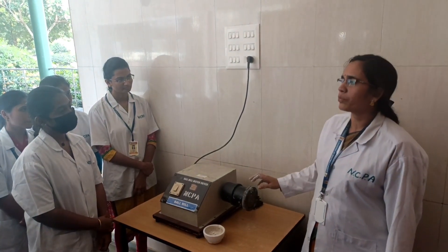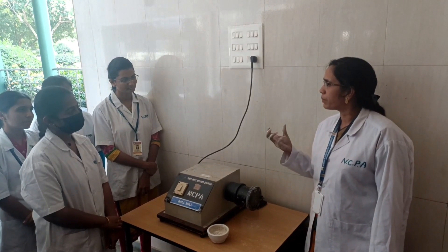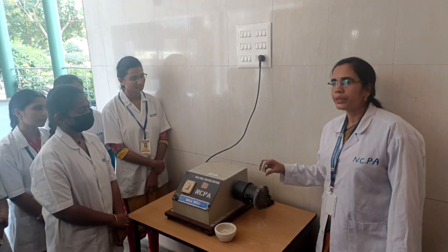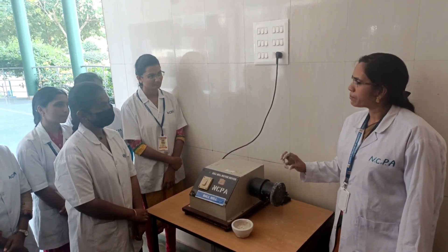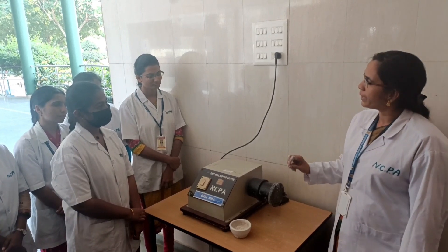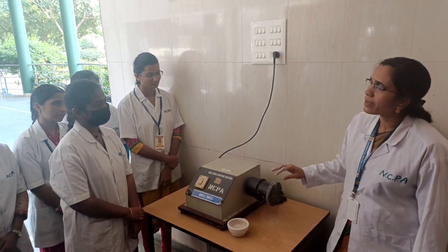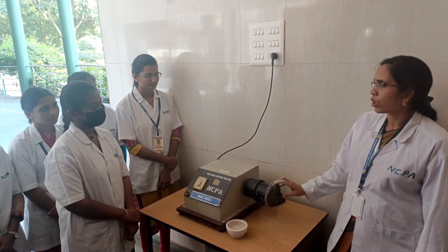After a certain period of time, depending upon the size of the pebbles or materials used in the hollow cylinder, due to the attrition caused by those bars, the bulk material will be converted into very, very small sized particles. Due to this, loss of product is very very less and the potency won't be lost at all.